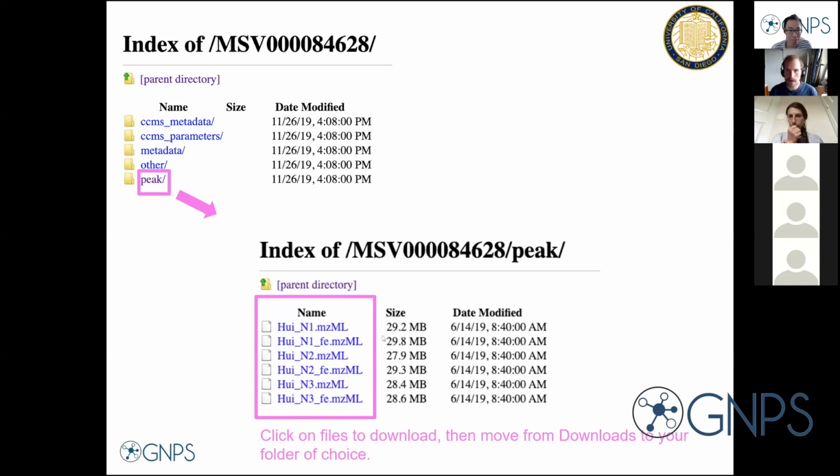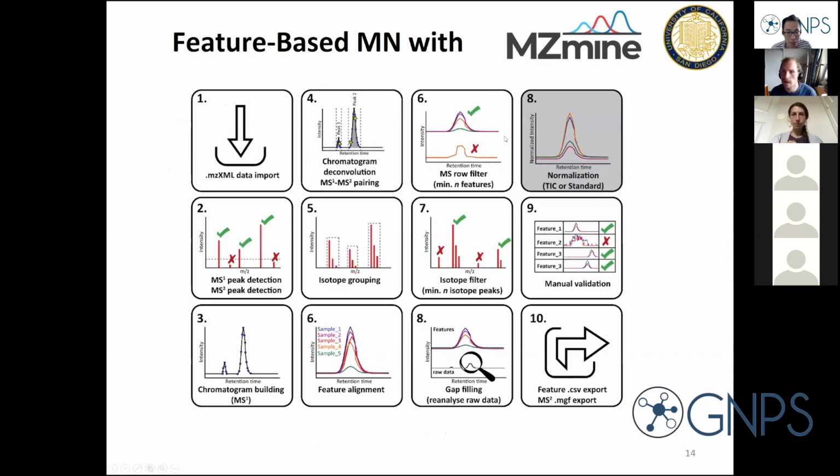And before I open the software on my computer, I just want to give you that little overview figure here. And all the slides we're showing right now are available in the Google Doc we shared with you, from which you got the Zoom information. So I assume that you should have access to that. So feel free to download the PDF.